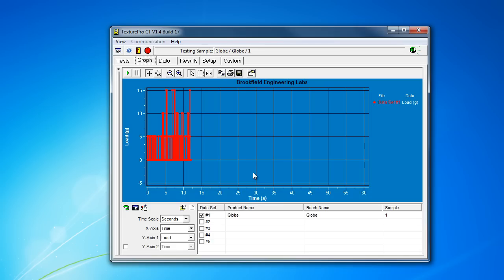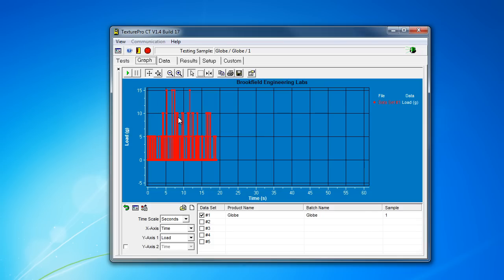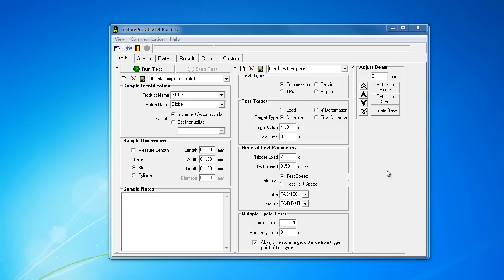It looks like we had the fact that this doesn't look anything like what I was hoping. I'm assuming that's a false trigger. Once this finishes, I'm just going to adjust the test settings to compensate for that.